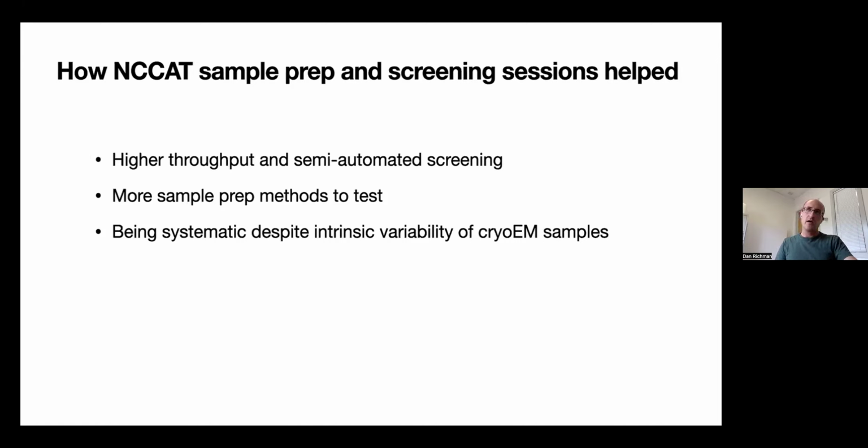But I think a mistaken approach that I took earlier on was sort of changing too many variables at once, jumping around to different parts of the parameter space without systematically changing something that could have been close to working. At the screening sessions with the coaching of Eugene and Kasahun and other staff, we really narrowed down that no, there's probably a part of the variable space that's working well. Let's fix those and then only change one thing at a time.